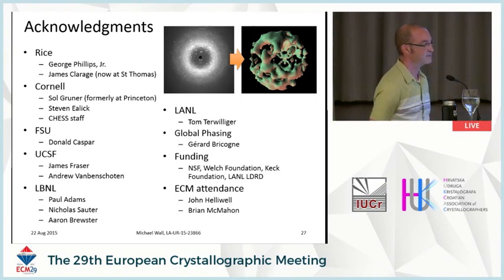I enjoyed it. Do you have any ideas about, let's say, guiding people in collecting diffuse scattering images? I mean, if we do a single crystal data collection and you have a rough idea of what the I over sigmas would be for a reflection on the edge of the resolution limit, do you have any experience with how to determine this for diffuse scattering? So what should be the signal over noise in the background or in diffuse scattering? Do you have any guidelines?